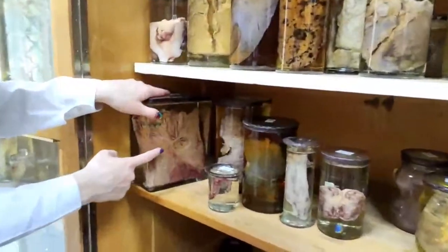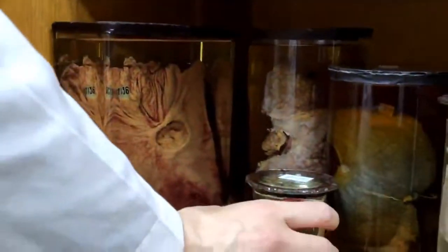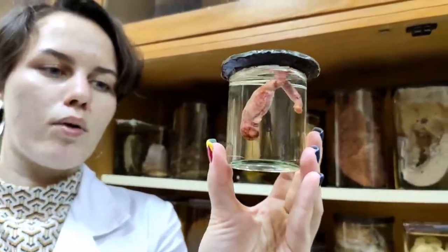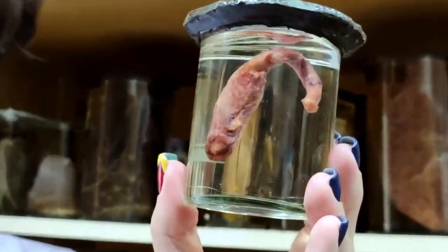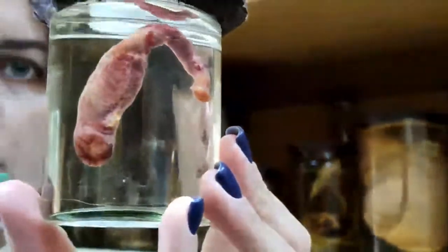The next one I showed you, this is ulcer of the stomach. This one is appendicitis, phlegmonous appendicitis. It's also an example of exudative acute inflammation. And here we can see that the appendix is enlarged.